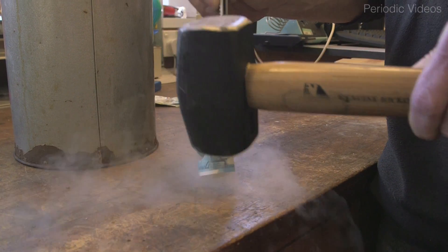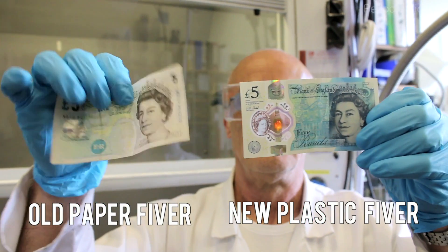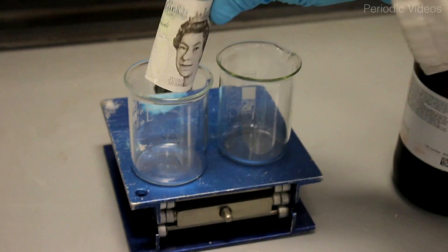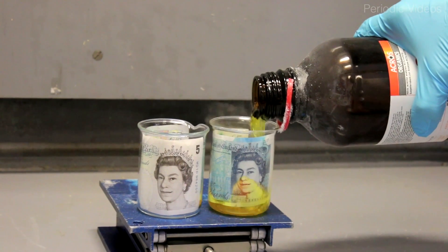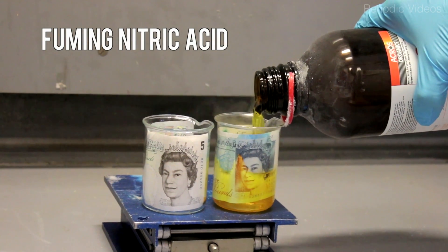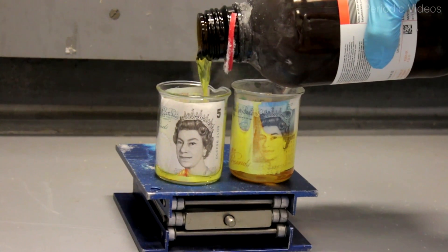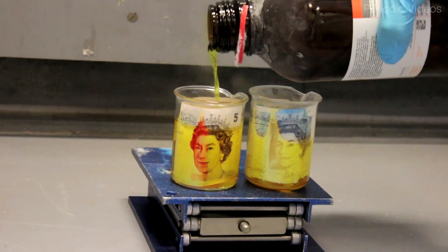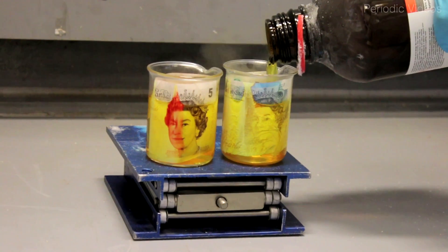Neil felt that this wasn't really quite exciting enough, so he decided to put the note in his special supply of fuming nitric acid. It's a bit old, so it's gone brown, which may make it even better. Essentially, it's a mixture of pure nitric acid with N₂O₄ — dinitrogen tetroxide — added to it, and N₂O₄ itself can dissociate into NO₂. So it's quite a witch's brew.